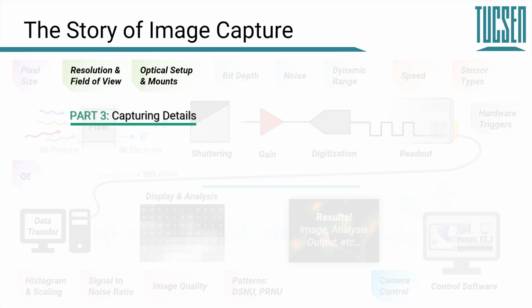First of all, resolution is this question of how fine a detail can we actually measure in our image. It's one of the commonly misunderstood or at least poorly defined quantities in camera-based imaging, where in scientific imaging we mean something quite specific by it, and we're going to be drilling down into what exactly resolution is, how to optimize it, how much of it we might need in this section.